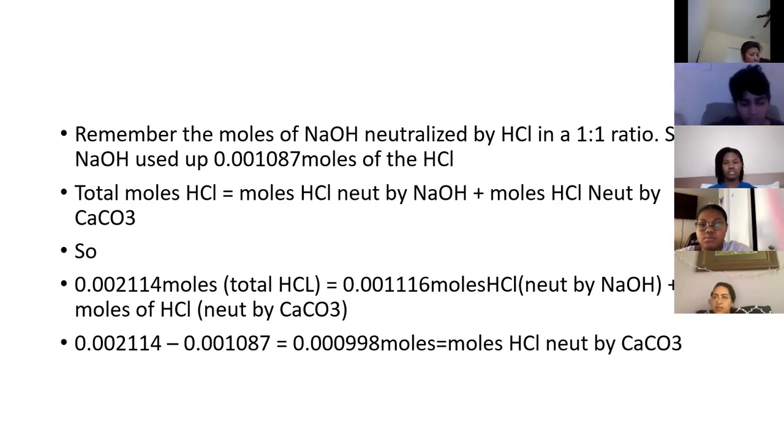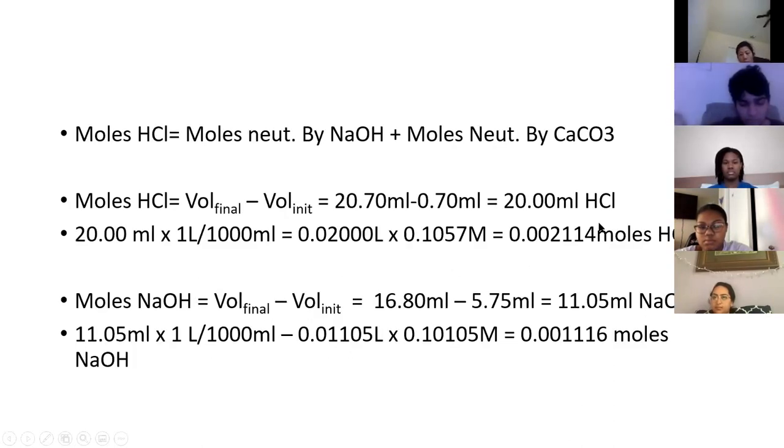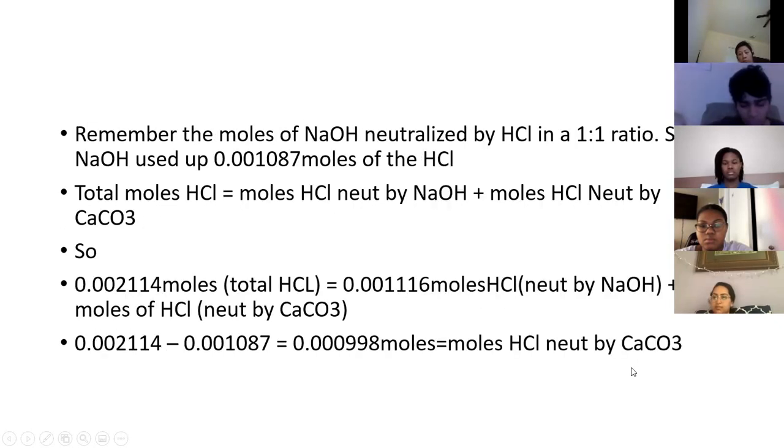You would find the moles of what? NaCl, or HCl, I mean. We've already got that. We took the volume of my HCl and multiplied it by my concentration. I have my moles of HCl. I have my moles of NaOH. So CaCO3, how am I going to get that? By getting the moles of HCl and NaOH and subtracting them. Absolutely. That's exactly what I'm going to do now.